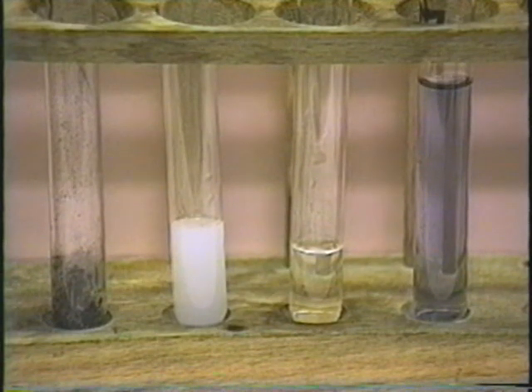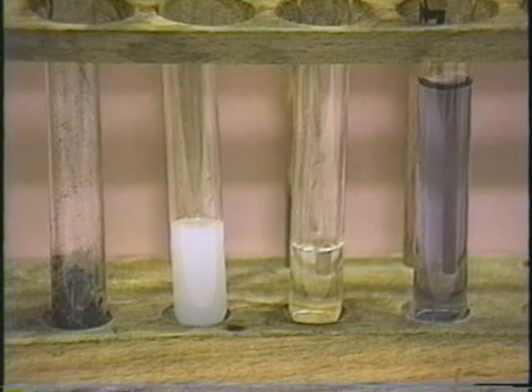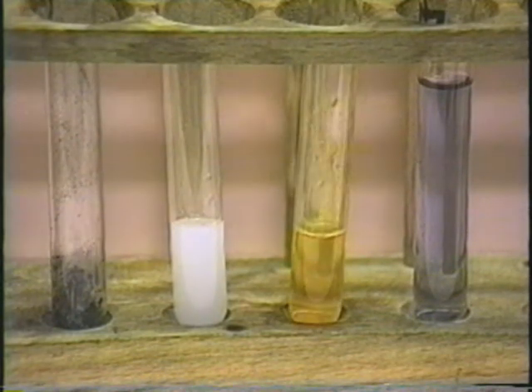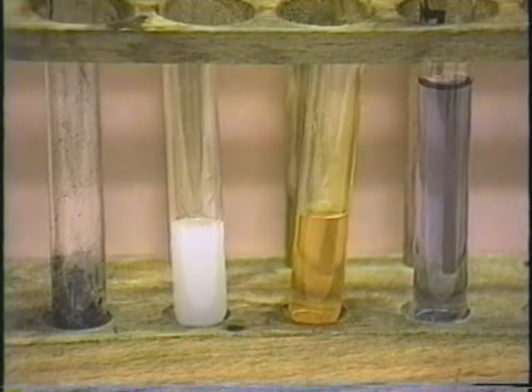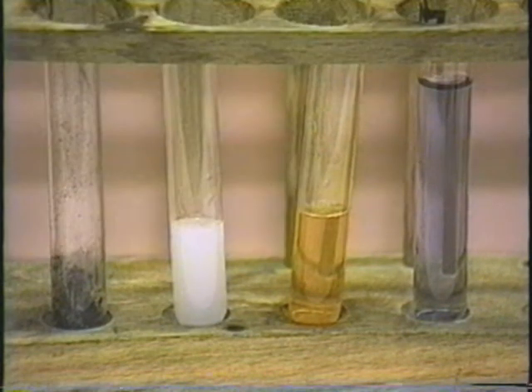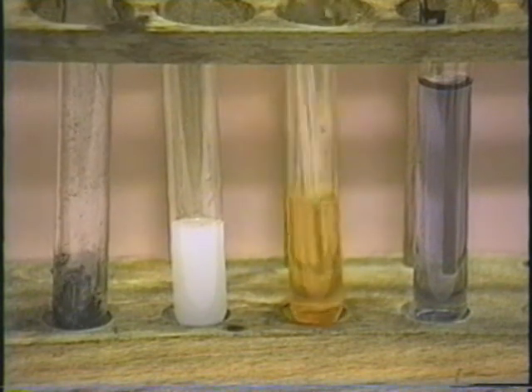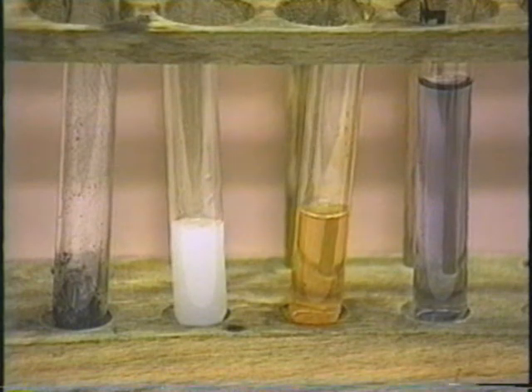Again, in close-up, we'll add a drop of acetic acid, then we'll add some potassium chromate, and as you can see, no precipitate is forming here. We'll stir that up a little bit. There's no precipitate formed.